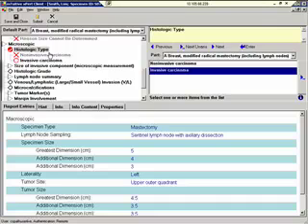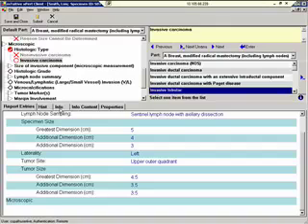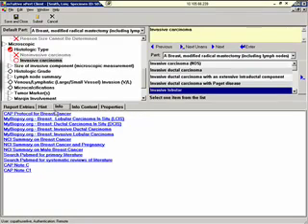Obviously, this is not possible with paper forms, and it's another advantage of using an xPert system. Let's take a moment to learn how the Info tab works. We'll begin by highlighting invasive lobular. We'll click on Info. You can see that the system only provides you with context-sensitive info that's applicable based on where you are in the report.